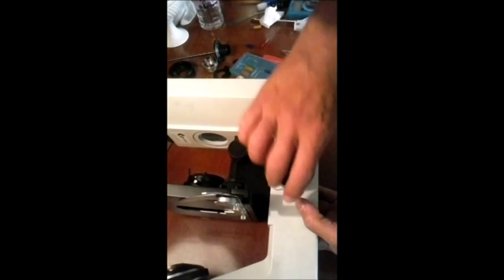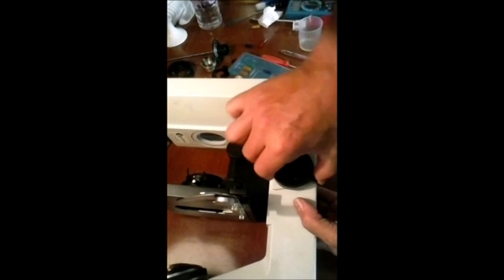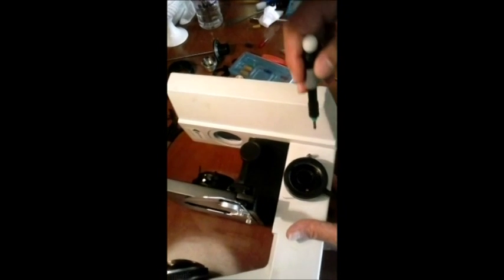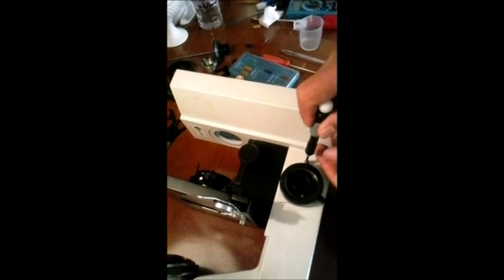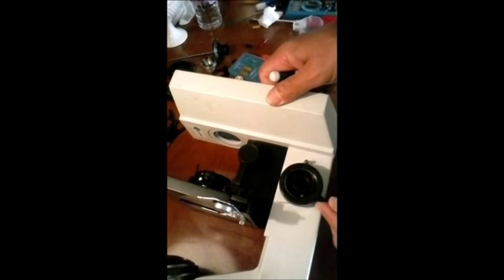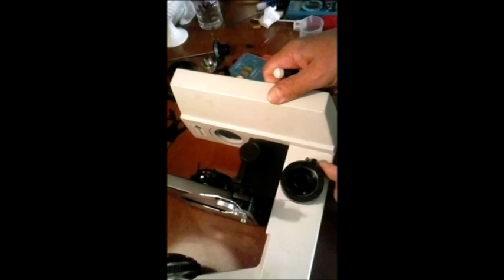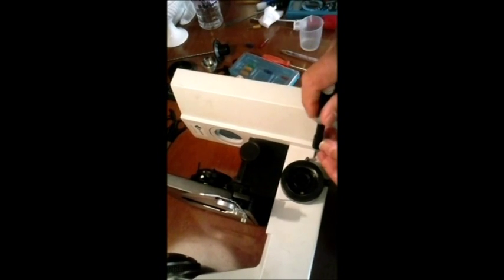Vamos soltar o botão trava. Esse botão aqui é o que trava o macrométrico, ok? Tá fazendo a leitura de uma cultura, quer travar a mesa, chega aqui nessa alavanca. E a alavanca trava.